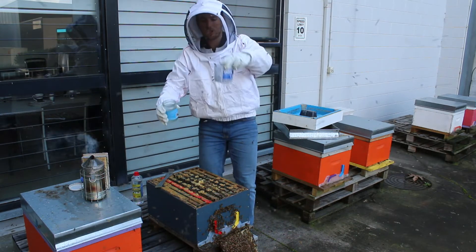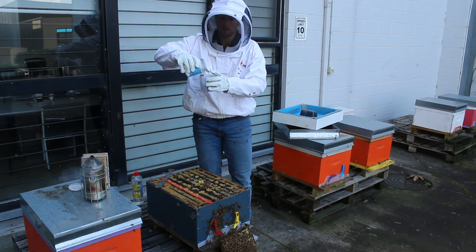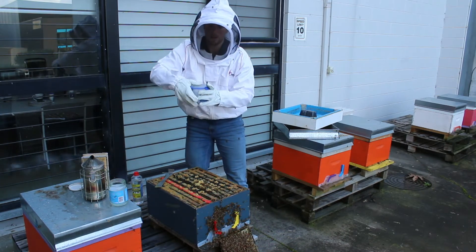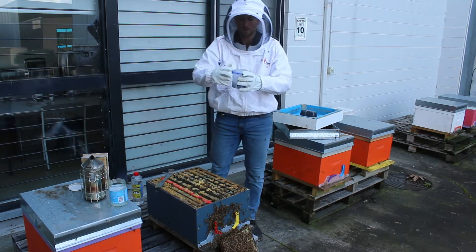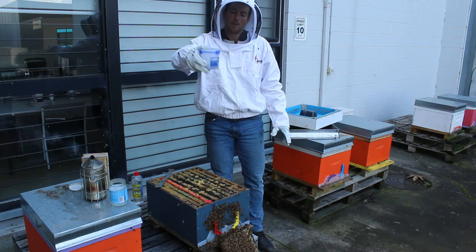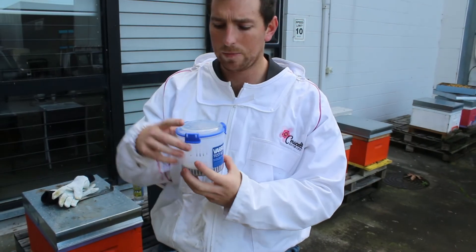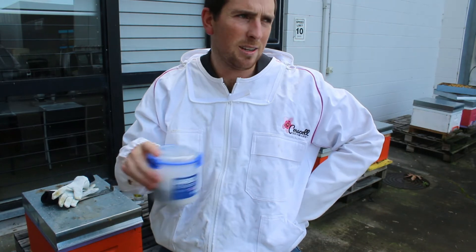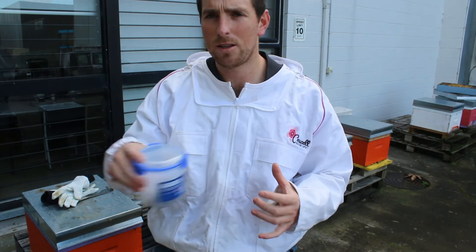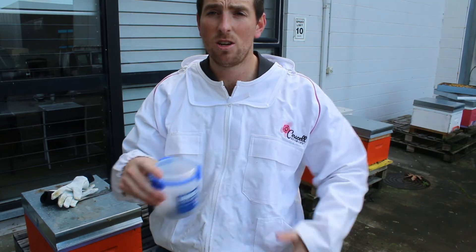Then we gently drop them down and fill up with alcohol, close the lid. From there you fill it up just a little bit and then you just shake for 30 seconds — basically stir it for about 30 seconds to a minute. That way all the varroa fall down to the bottom and then we can work out what our percentage of infestation is.